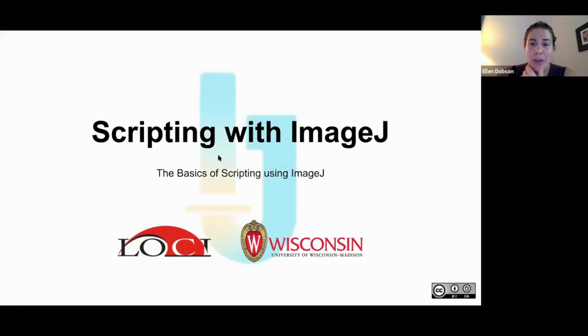Okay, in an image with a crowded set of cells, is there a method of watershed that provides more fine control? Yeah, the method I showed you is the built-in, that's how the built-in watershed in ImageJ works, but there are tons of different watershed algorithms. There are different ways watershed can be applied.